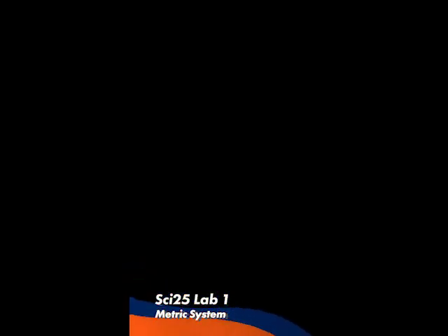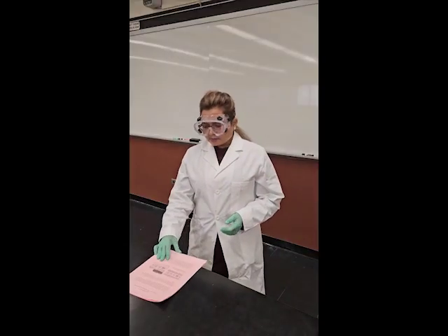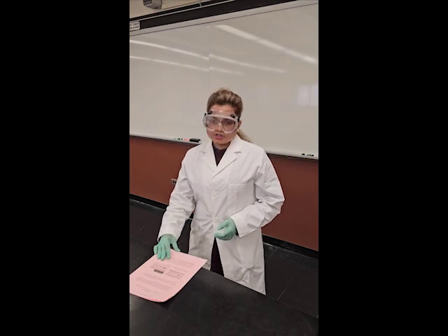The Science 25, experiment number 1. Before you come to the lab, make sure you have the lab journal with you. This experiment is about the metric system, density and temperature.